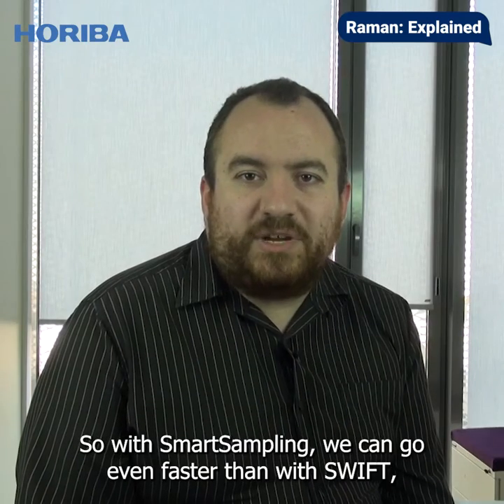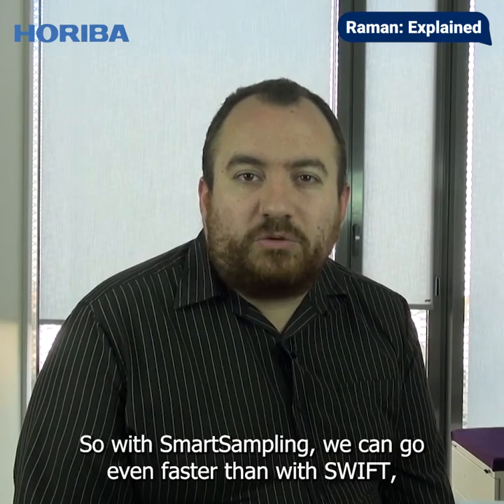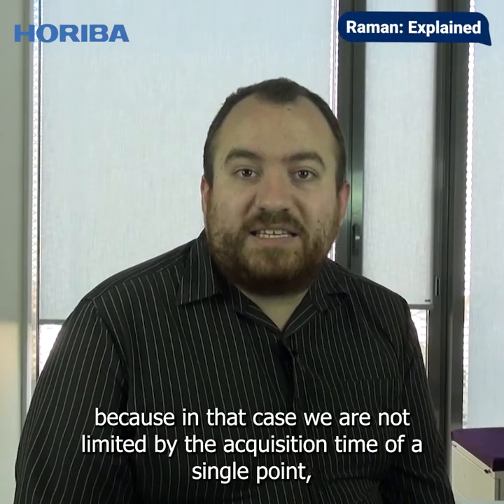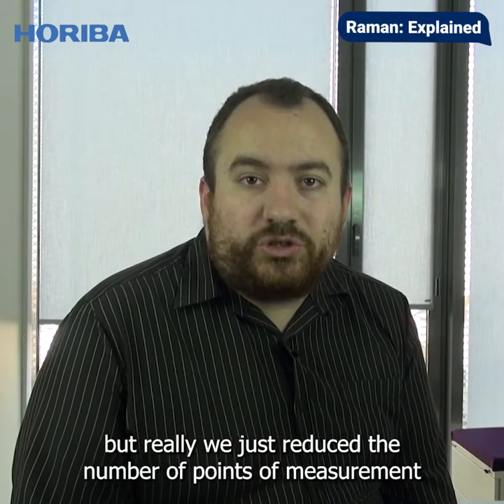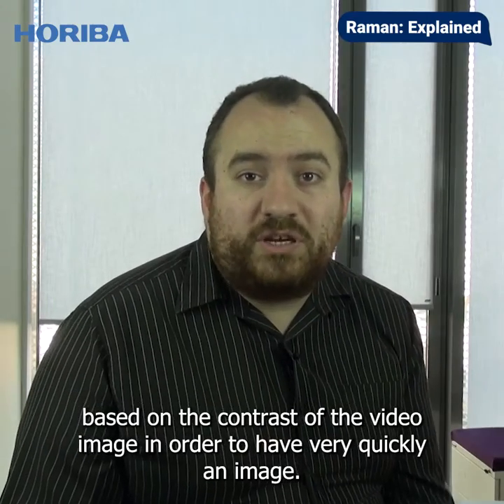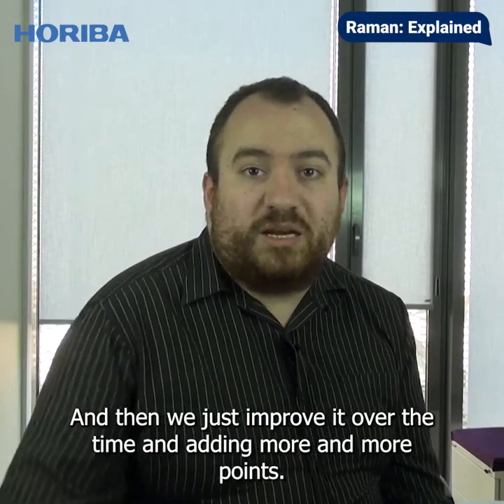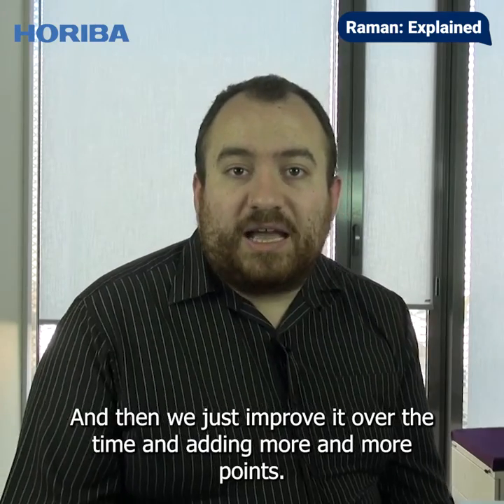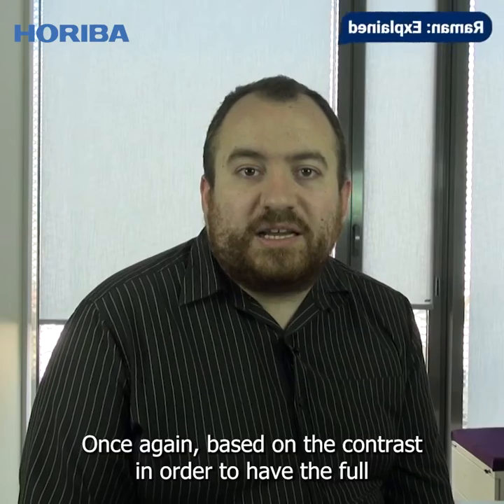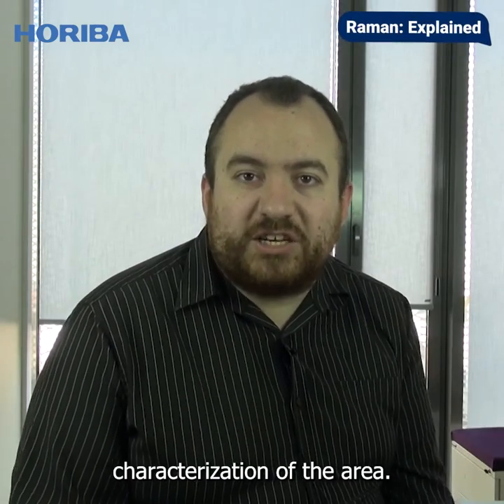So with smart sampling, we can go even faster than with SWIFT, because in that case we are not limited by the acquisition time of a single point, but we really just reduce the number of measurement points based on the contrast of the video image in order to have an image very quickly. Then we just improve it over time by adding more and more points, once again based on the contrast, in order to have the full characterization of the area.